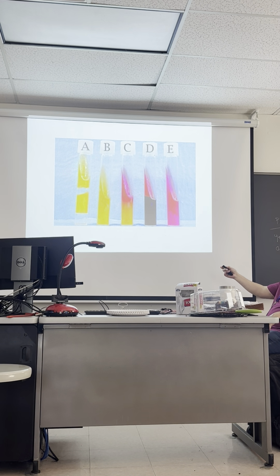How about this one? I got fuchsia here, black there, go. K, A, H2S, very good. So how about here? I got yellow here, and I got cracks and fissures, go. A A gas. Okay? Good? Let's do one more. I got fuchsia there. K K, no gas.